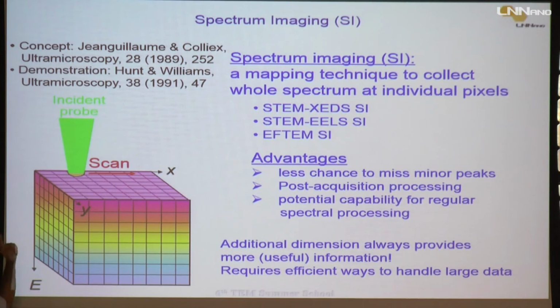And then, by the acquisition of this, you arrive with the data cube, okay? The data cube is something like your image, but with all the spectroscopic information in Z, okay? And with this, you can do post-acquisition processing. You have the data cube, and then you just go there and get some layers of your cube that will be related with what?